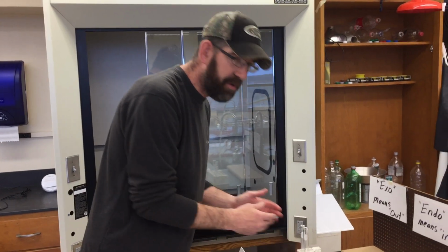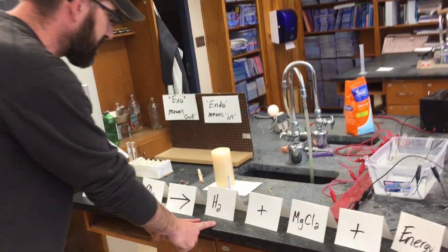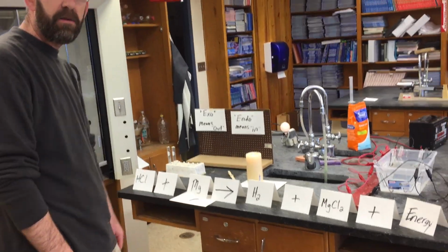So, the heat that was produced was on the product side. We proved that hydrogen gas was present by lighting it off and getting that little small explosion.